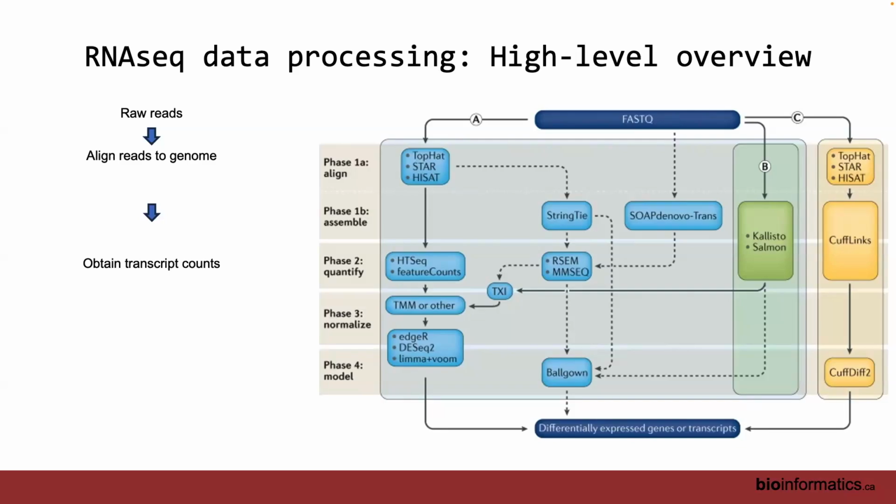You guys know what a SNP is? A SNP is a location in the genome that varies in 1% of the population, or 5% of the population or more, right? That's the major source of human variation. Our DNA is not 100% identical. There are hotspots in the genome where there is a high degree of population variation, right? So if the aligner was always looking for perfect matches, it would throw out a lot of these reads, right? So these are the kind of things. So the aligner keeps score, and then finally, it bins things.